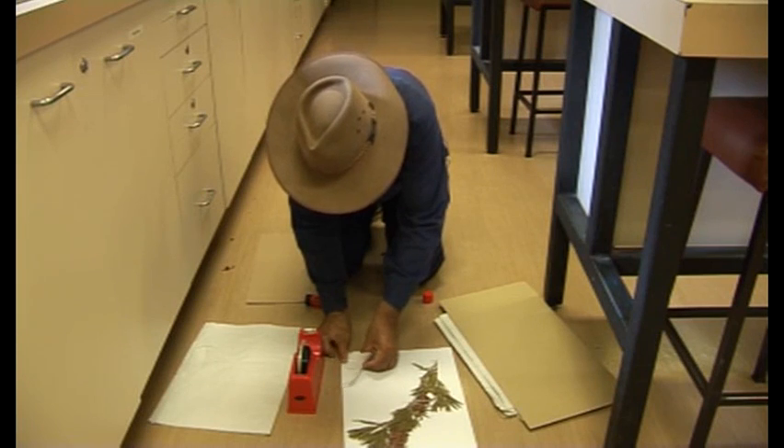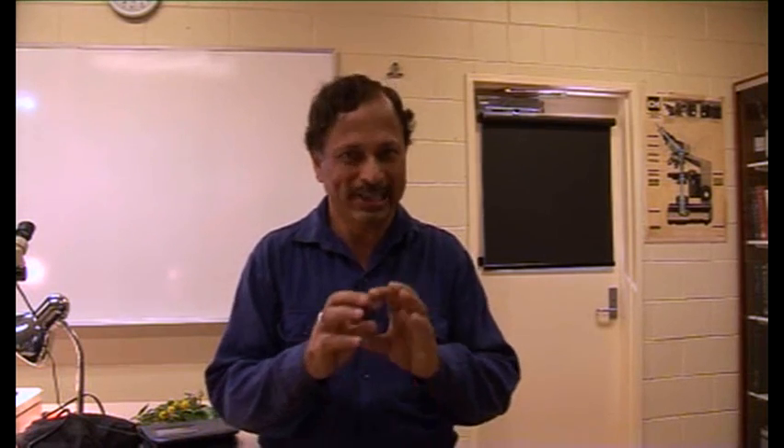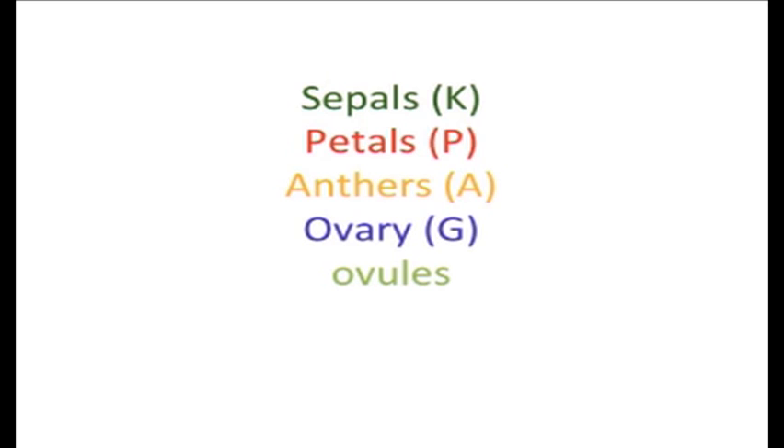We also have a spare flower which we need to dissect, to find out how many sepals, how many petals, how many anthers, how many ovaries, and how many ovules are there in that flower. This information is critical to identify the specimen to the genus and family levels. Without that information, it's almost impossible to identify or group the specimen to the genus or family levels.